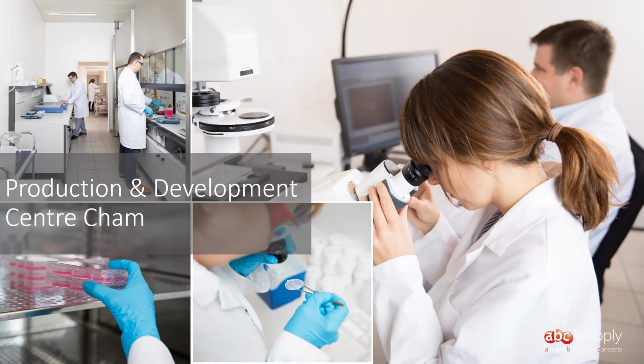And the good thing is, because all the spheroids within one chip have faced the same biological condition, they also act as biological replicates, and therefore they give you a very nice statistical readout at the end.